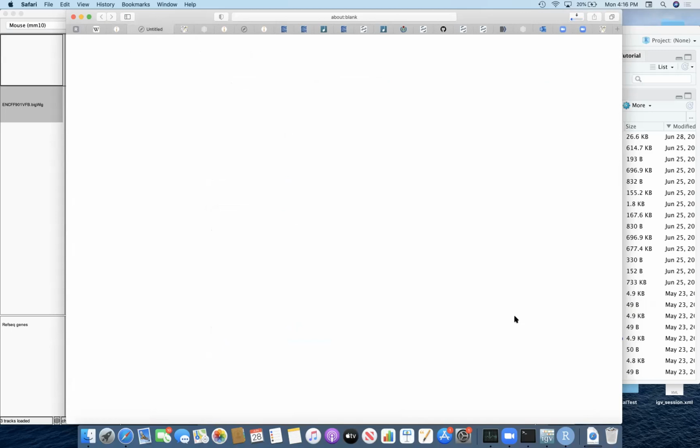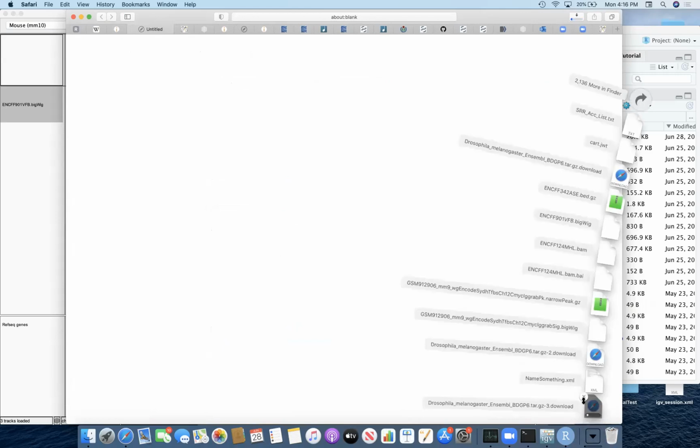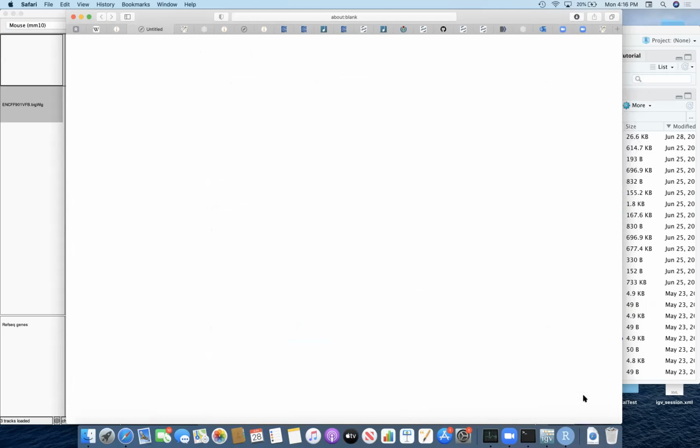I don't know. So I know that with iGenomes, in my background, it did just pull up a white screen, but it downloaded something as well. I know I've had problems with iGenomes before with older versions of stuff. So maybe just try getting an update to your browser. Okay, I'm using Google Chrome, so I'll go to Safari and try. Yeah, usually I think Google Chrome is pretty good.